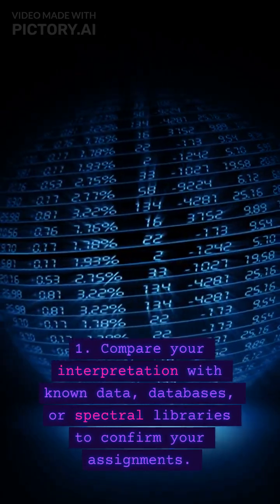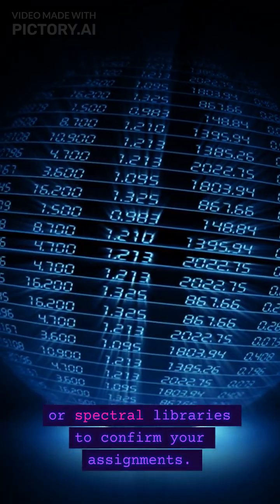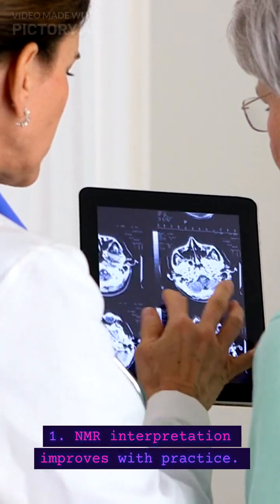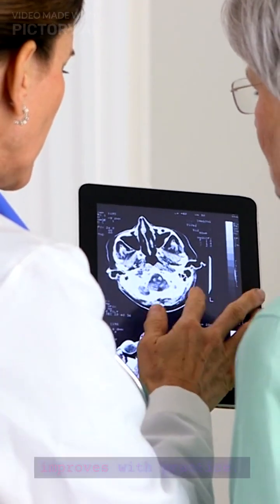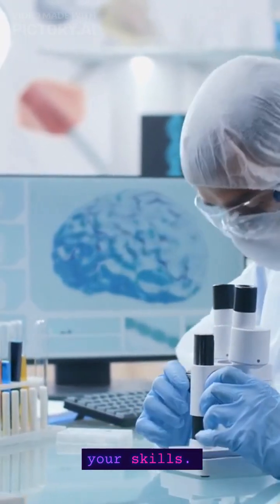Verify the assignment. 1. Compare your interpretation with known data, databases, or spectral libraries to confirm your assignments. Practice. 1. NMR interpretation improves with practice. 2. Work on a variety of NMR spectra to hone your skills.